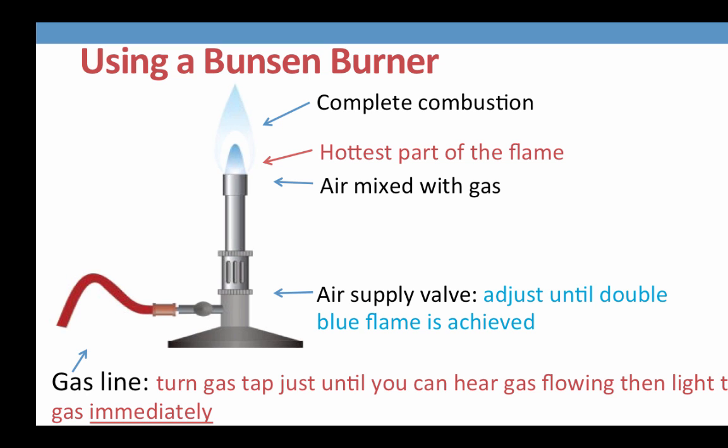We can then adjust the airflow to achieve a perfect dual flame by adjusting the air supply valve at the base of the Bunsen burner. Simply twist this valve until you can see a clear distinction between the inner blue flame and the outer blue flame.